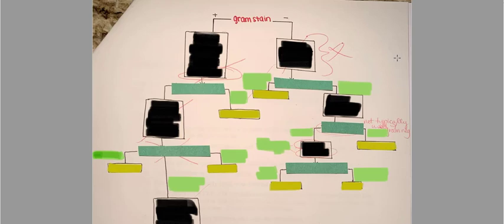So if you can imagine, if you walk into the laboratory, you have your bacteria, you do your gram stain, you say, okay, it's a gram positive. So now you know you have one of these organisms here. Or it's a gram negative. Now you know you have one of these organisms here. So you must, in your diagram, have whatever you're separating out, every single organism that would be the positive or the negative for that, or whatever the positive negative equivalent would be.